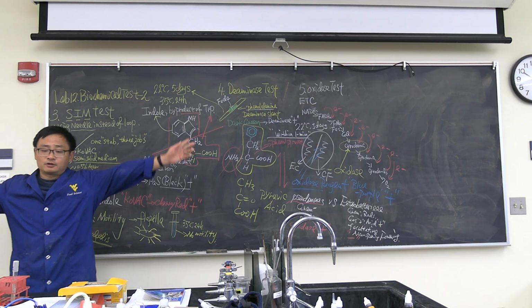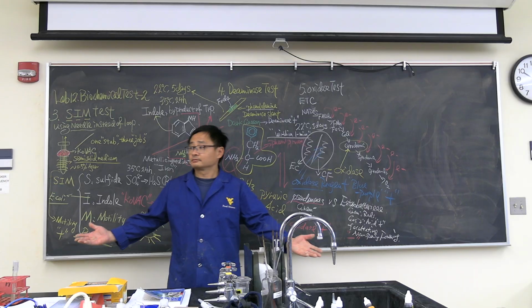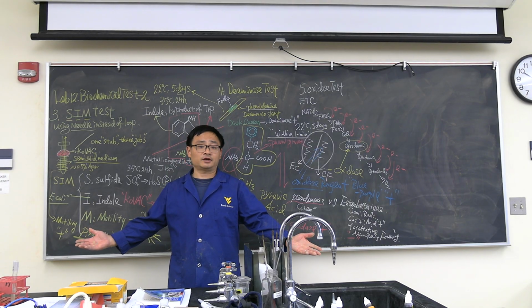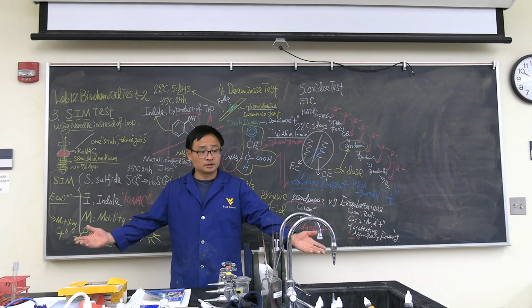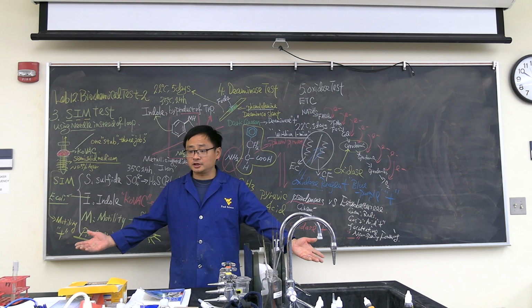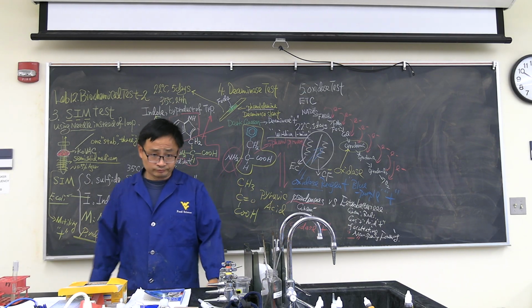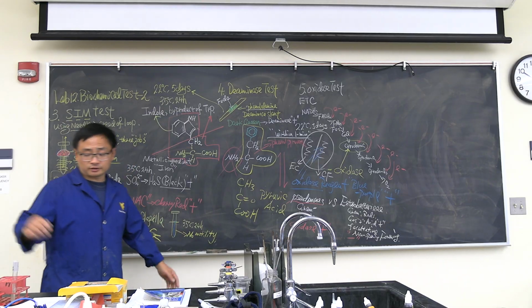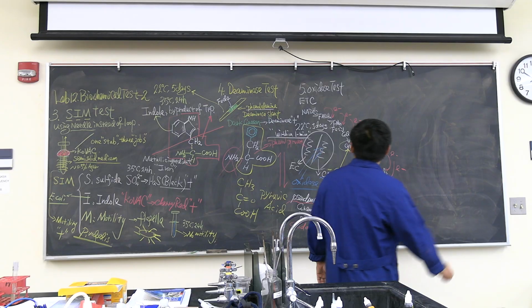So, which bacteria are oxidase test positive? Neisseria, is that right? Neisseria gonorrhea or Neisseria meningitis. Especially gonorrhea, we said we know the people do the sexual activity. Why? Oxidase test positive, turns purple color. So that's something connected to the lecture, just want to let you know, okay? Oxidase test. Last one.